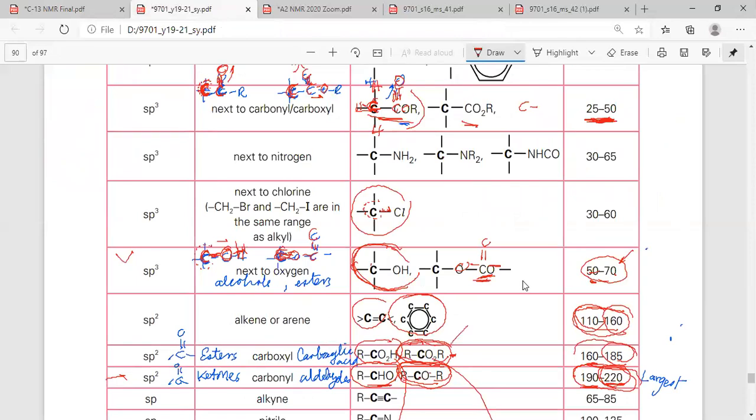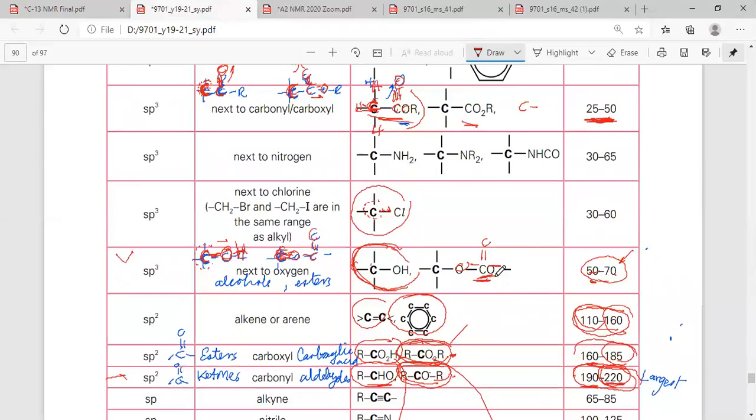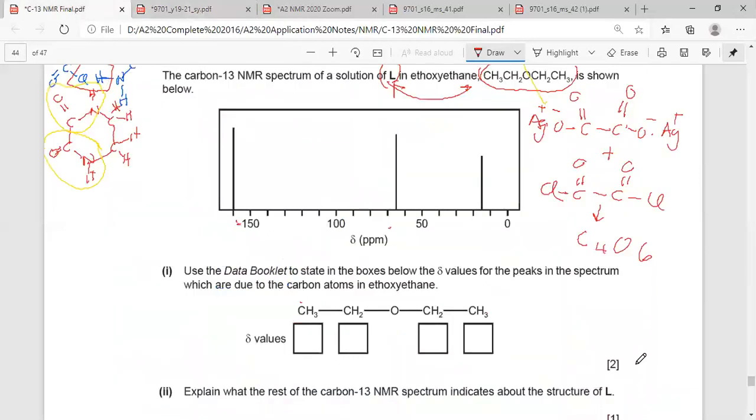Now this thing here is for your ester. Now here is for your aldehydes and ketones. Remember? Now is there an ether here? Ether here, no ether here. That means it's around here. This is the closest you can get. Now C–O: let me see here, 50 to 70. Carbon to oxygen, this is the closest to get, about 65.